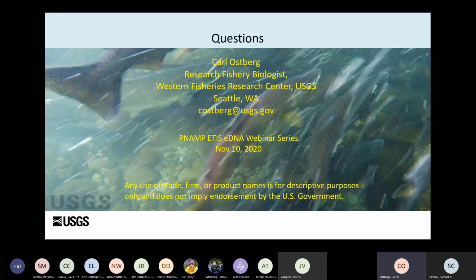Yeah, I think cleanliness, maybe. Just doing everything on one benchtop, all of your methods on one benchtop. I think it's really important to have separate spaces for eDNA, where you're doing the DNA extraction in one place, you're pipetting out standards in another, and you're pipetting out your master mixes in another place.